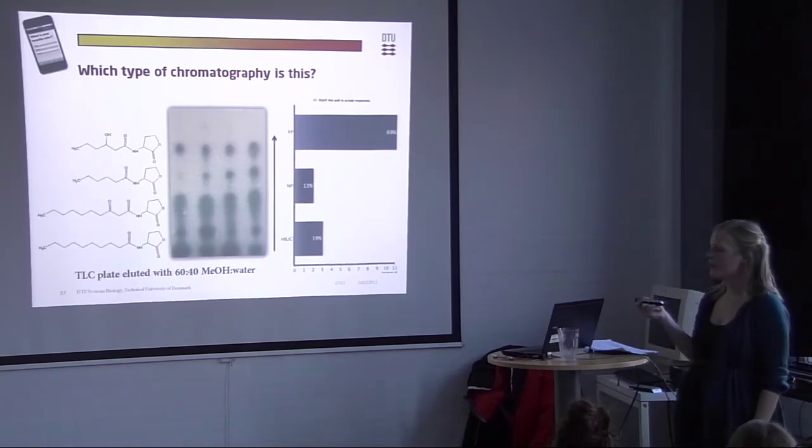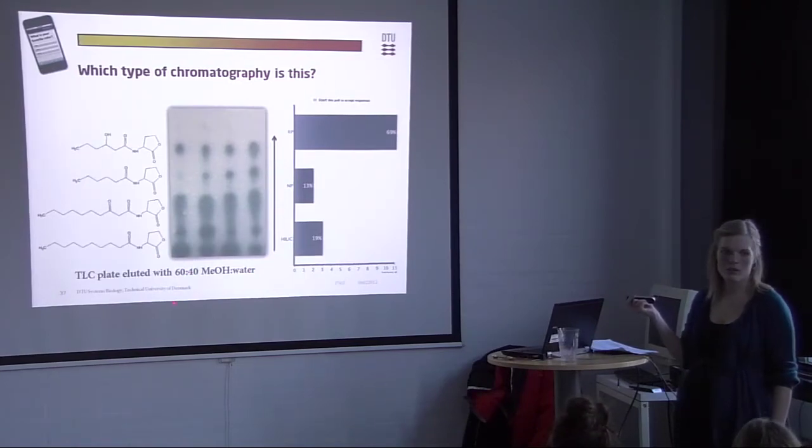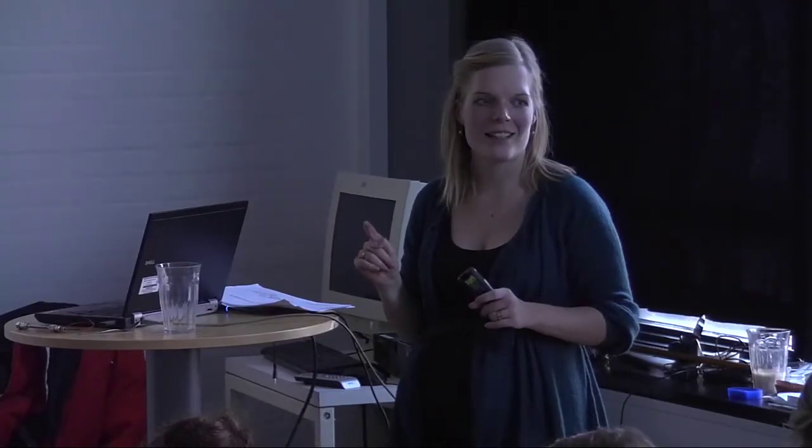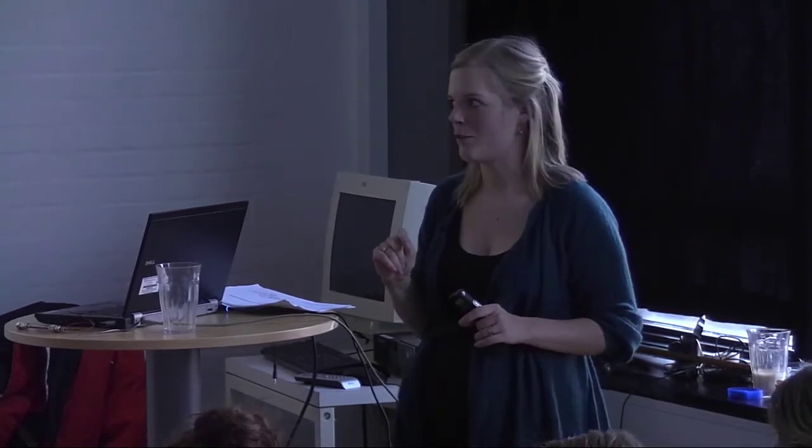And also, if you were in doubt between normal phase and HILIC, you could see that on the solvents because we added water, which is a no-no in normal phase. So this is the way that you can recognize these different kinds of chromatography.